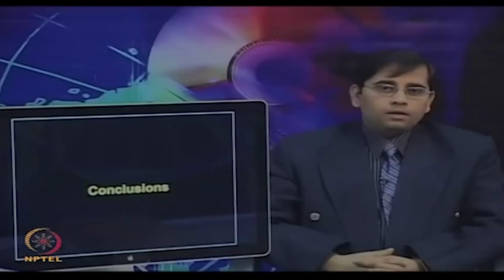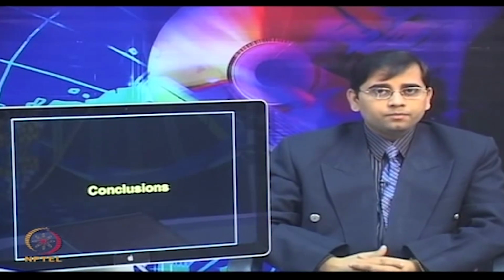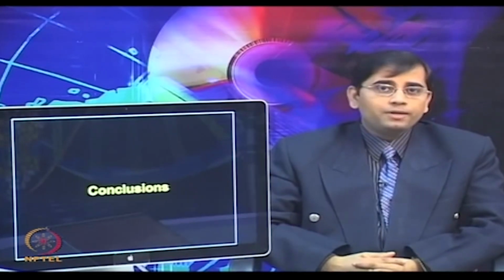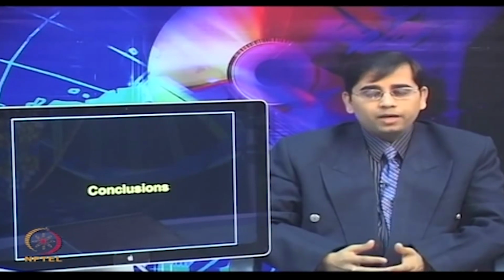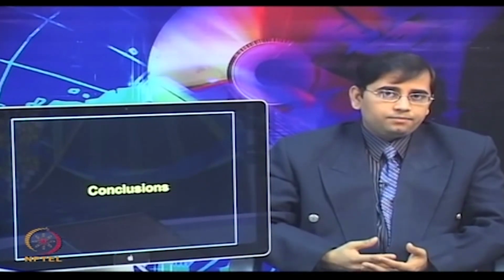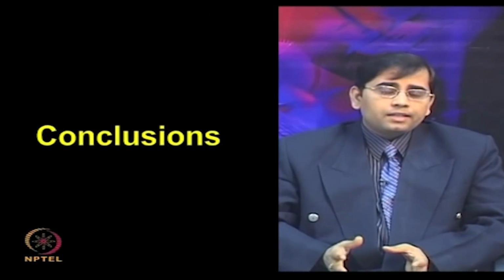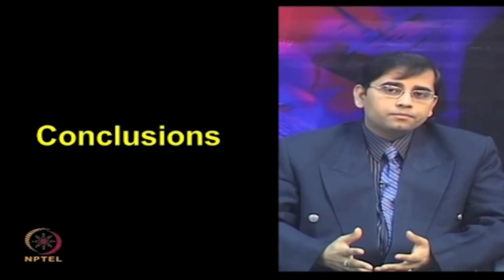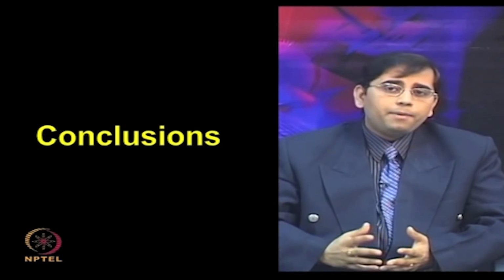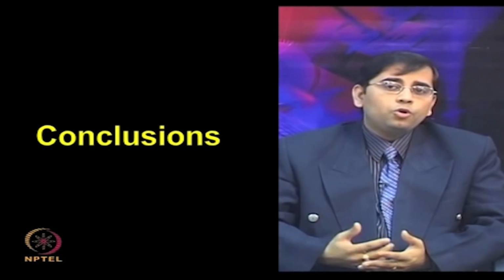Thank you. So after having a discussion with Lalit Kishore on Biacore SPR technology, I hope now you are very clear about the instrumentation, the various properties which can be studied by using the Biacore system, and how quickly one can perform the data analysis. The conclusion from this whole discussion is that since the introduction of the Biacore SPR instrument, SPR spectroscopy has become widely used from chemistry and biochemistry to characterize biological surfaces and monitor biomolecular binding events.